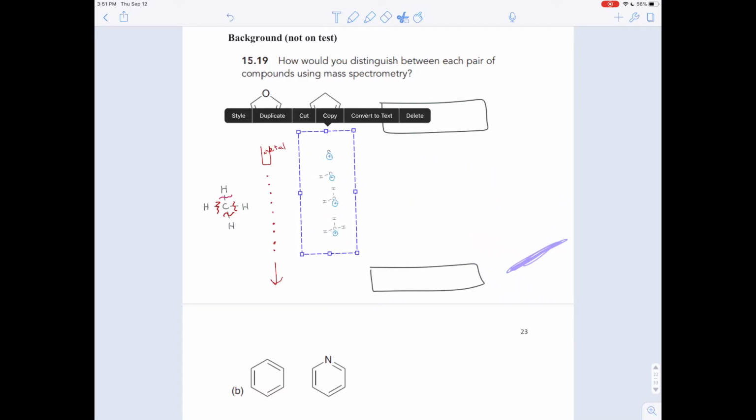The fragments that are the lightest, that are the least massive, those turn the most. And the fragments that are the most massive, those turn the least. Imagine you're driving a small, tiny car. It's easy to turn the car left and right. Imagine you're driving a really big, heavy truck. It's hard to turn the truck left and right. The more massive something is, the harder it is to turn it.